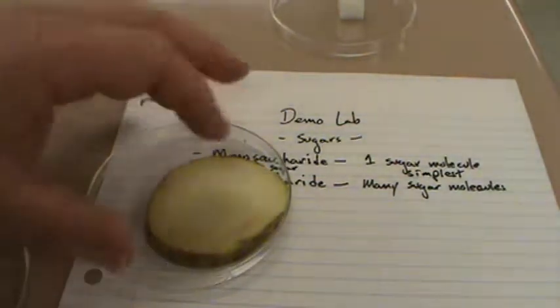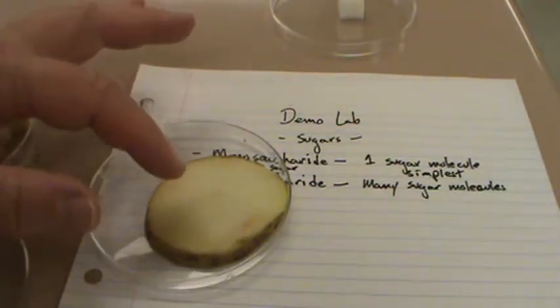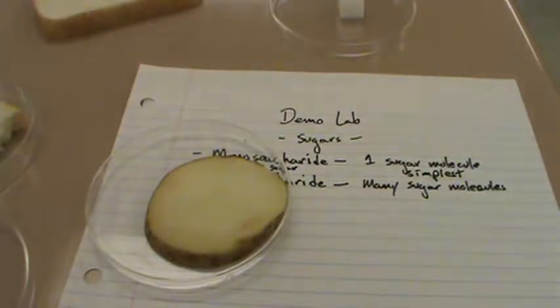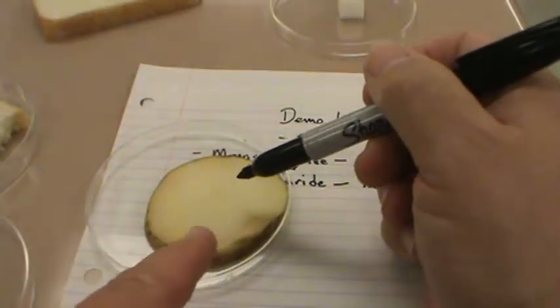This type of carbohydrate is a little bit more complicated than the C6H12O6 that we learn as the product of photosynthesis. But what this becomes is food storage.